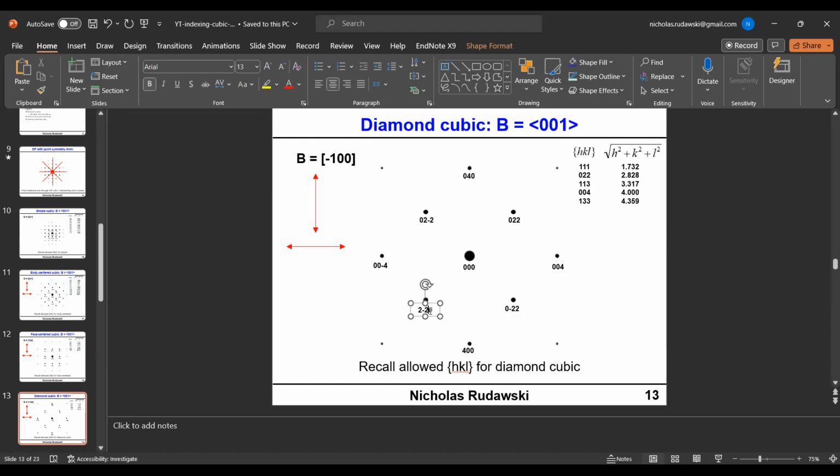Then this becomes 0, 2 bar, 2 bar. And this becomes 0, 4 bar, 0. So this would again be another perfectly valid solution, where we're not applying the soft rules. If we started from this, we could get this, and then we showed how we could rearrange these if we wanted to.